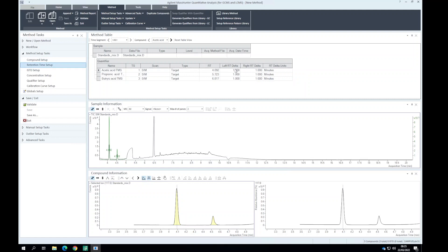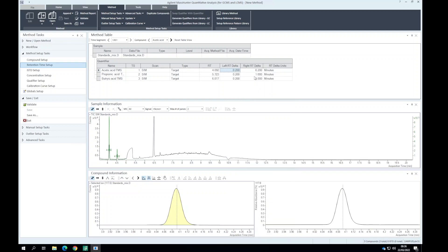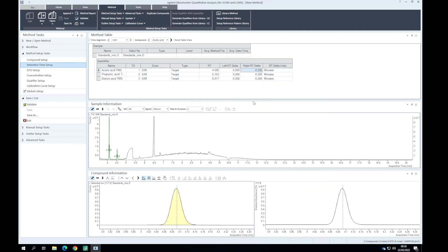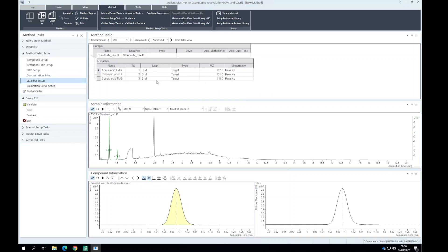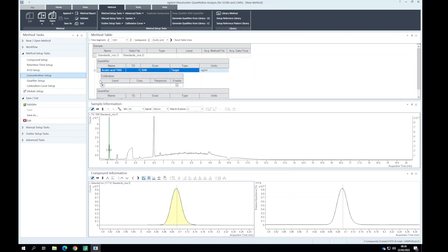For retention time setup, because this is GC data we don't need a very wide window. We don't expect a lot of drift or matrix interferences. For internal standards we haven't built that into the method yet. For our qualifiers let's quickly add those.